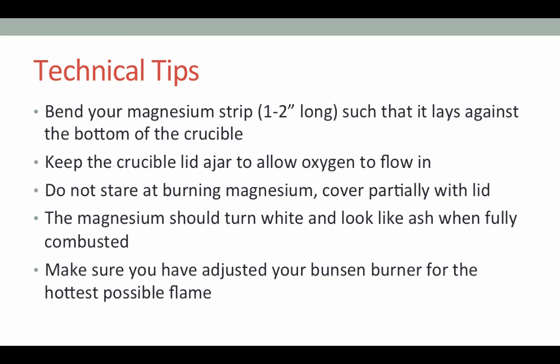It's important that the lid is atop the crucible, however, because when the magnesium burns, it emits bright UV light that can damage your eyes. So put the lid on, but leave it a little ajar to let the air in. Also, just as I mentioned, do not stare at the burning magnesium, as it will hurt your eyes. It's very, very bright. Once your combustion is complete, the magnesium should look like ash. It should be flaky white, and there should be no remaining silvery metal.